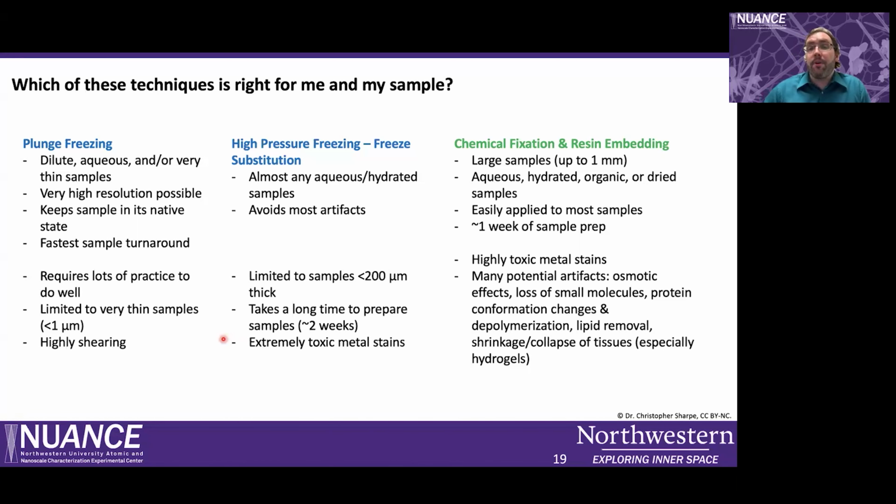For high pressure freezing freeze sub, you can look at almost any aqueous or hydrated sample. You just need enough water content that we can freeze it. And you're going to avoid most of the artifacts that chemical fixation will introduce. On the downside, you're going to be limited to samples that are less than about 200 microns thick, and it is going to take a long time to turn around your sample.